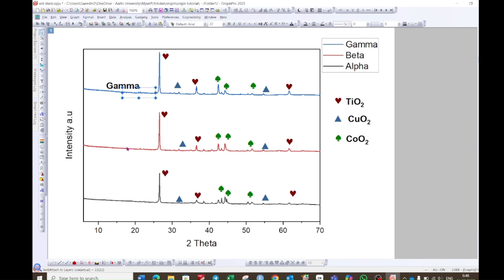Now select it again. Press Ctrl+C and Ctrl+V so that it will be copied. Click right next to the layer. I am doing it so that all of the font size and styles remain the same. Name them.